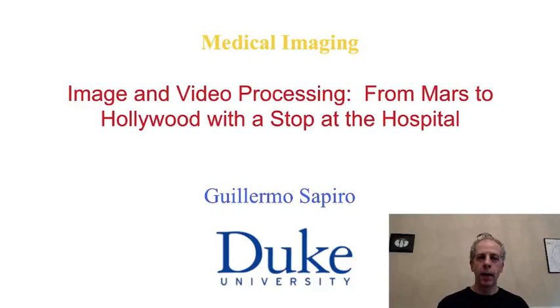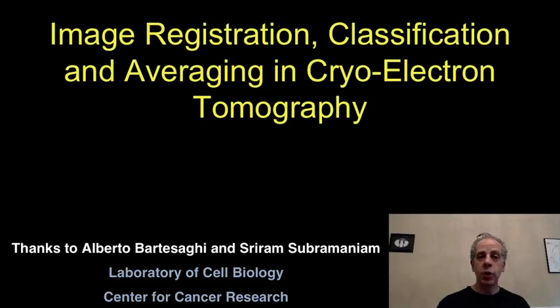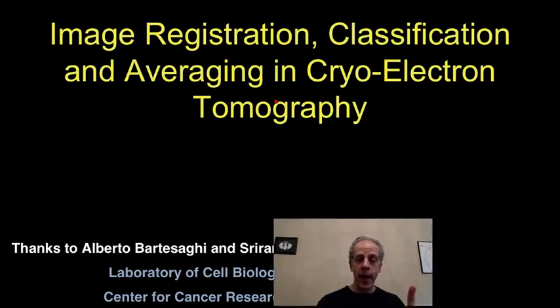Hello and welcome back. In this video, we're going to be talking about image processing in a very particular application in medical imaging, and this is image processing for virus understanding, and in particular, to understand the shape of the HIV virus. This actually brings a lot of challenges, as we are going to see. We're going to have to talk about many topics in image processing, including image acquisition. And let's start with that.